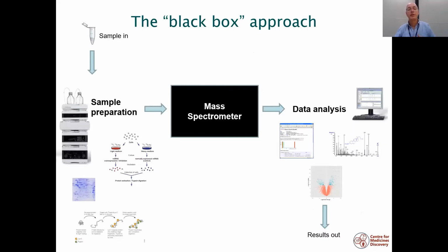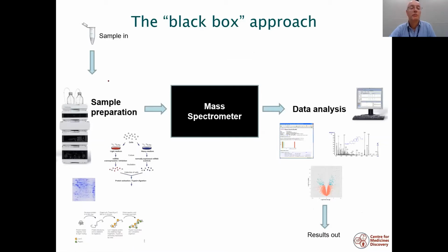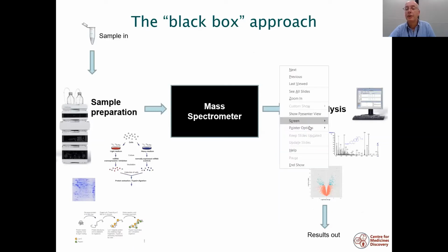So this is a typical workflow for mass spectrometry. There's a lot of work involved in sample preparation, and also a lot of work involved in data analysis.